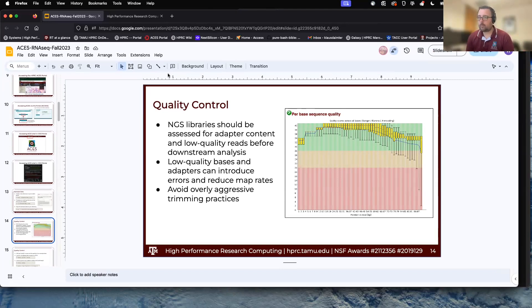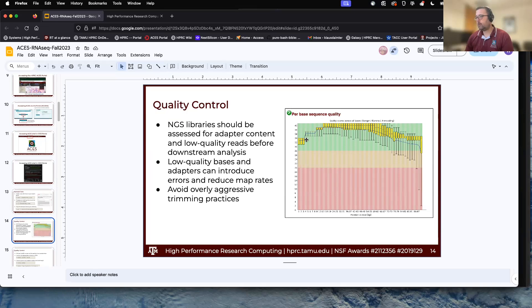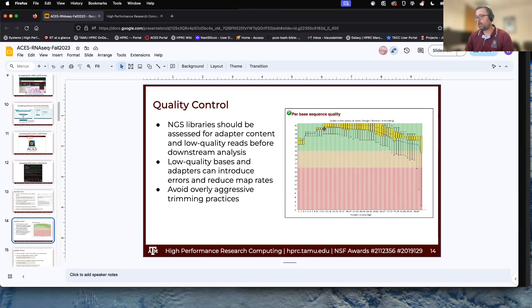We want to avoid overly aggressive trimming. The quality profile typically starts somewhat lower, gets really high quality in the middle of the read, then drops off at the end. Trimming too aggressively — say cutting 20 base pairs off either side — loses specificity of each read and will greatly reduce your mapping rate. We're going to use FastQC, which produces a nice HTML with all different quality statistics. On ACES, to find a program, do `module spider FastQC`.